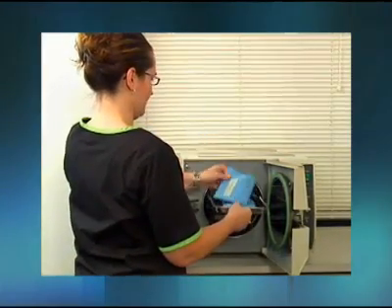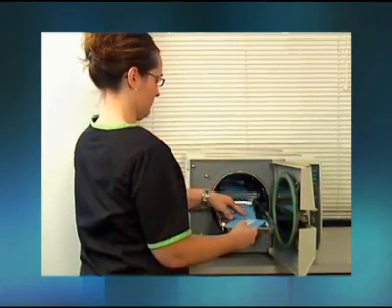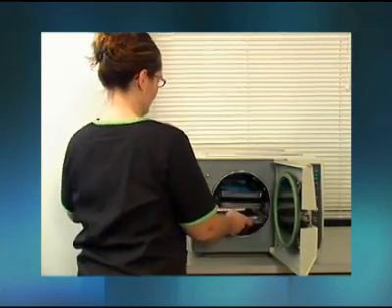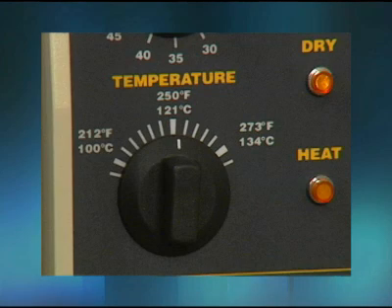The autoclave is a dependable, efficient, and economical way to sterilize items that are not harmed by moisture or high temperature. Sterilization of articles in the autoclave removes all microorganisms and spores. The autoclave is typically operated at 15 pounds of pressure at a temperature of 250 degrees Fahrenheit.